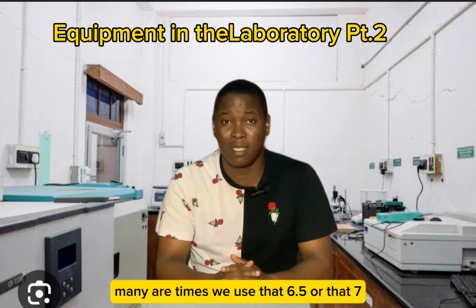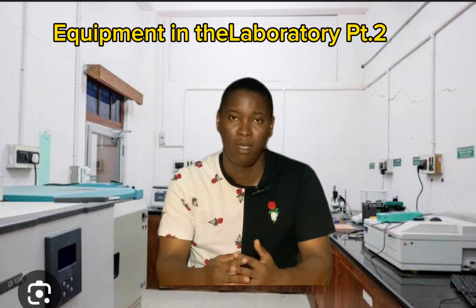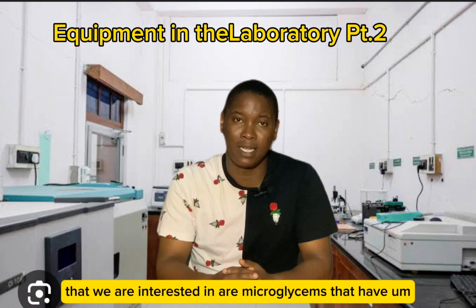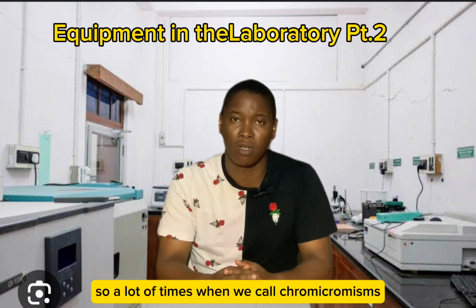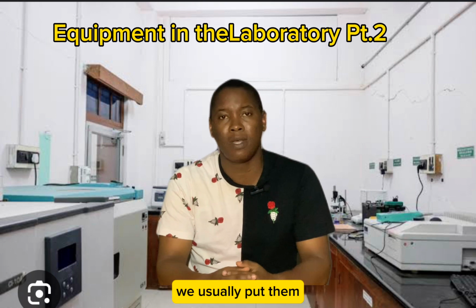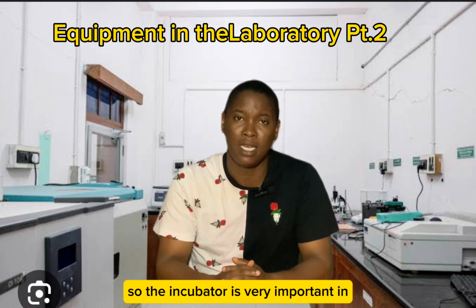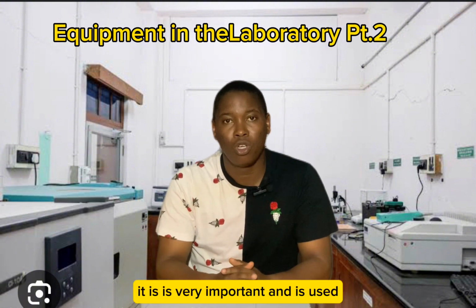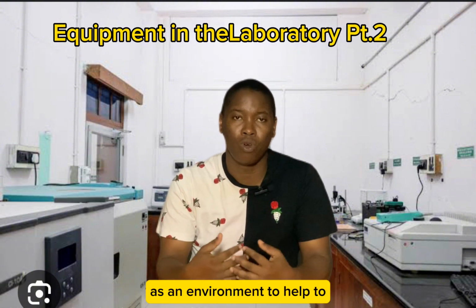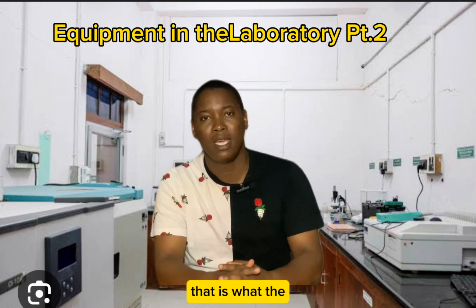Many times we use 36.5 or 37 as the temperature because a lot of the microorganisms we are interested in have impact on human health. So when we culture microorganisms, we usually set the incubator to 37 or between 37 to 42 degrees. The incubator is very important in the microbiology laboratory as an environment to encourage microbial growth. That is what the incubator does.